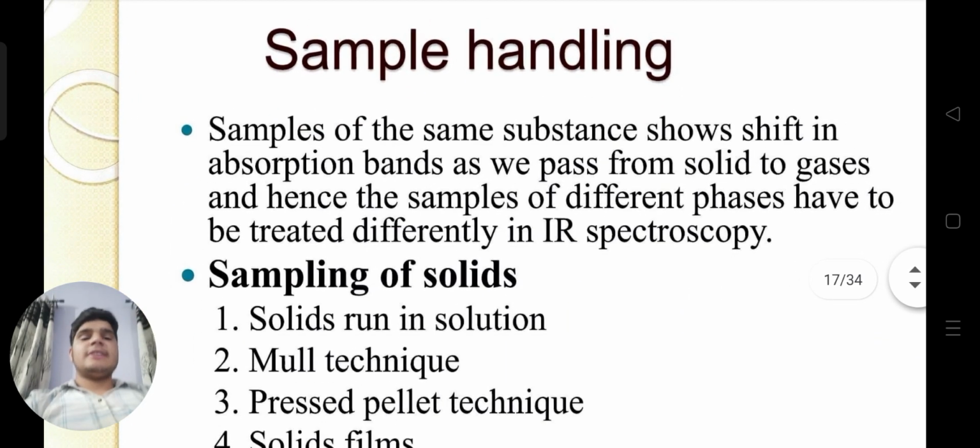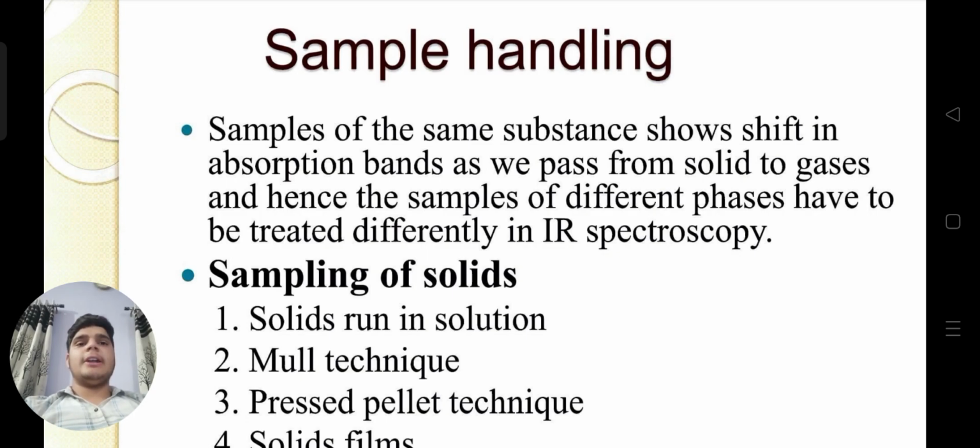Sample handling. Samples of the same substance show a shift in the absorption band as we pass from solid to gases, and hence the samples of different phases have to be treated differently in IR spectroscopy.